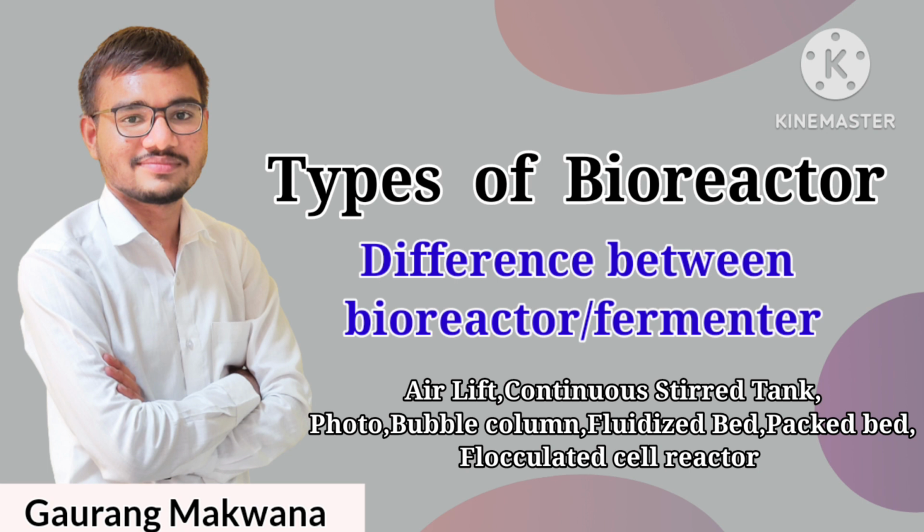In the previous video lecture, we discussed the design of a bioreactor or fermenter. In today's video lecture, we'll discuss the types of bioreactor or fermenter. Also, we're going to discuss the difference between a bioreactor and a fermenter. So today's video is going to be at a very interesting level. Stay tuned with us and enjoy this video lecture.